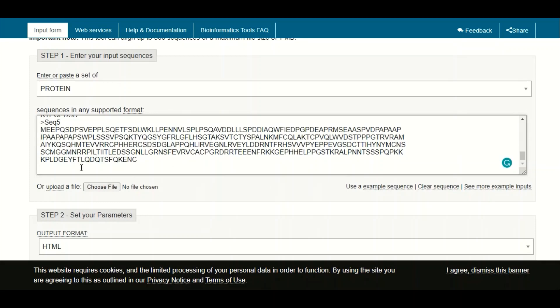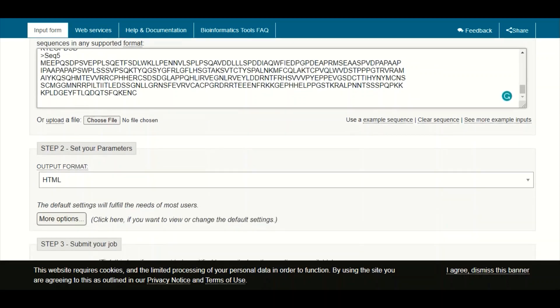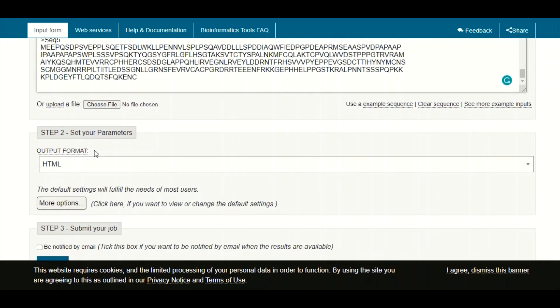Alternatively, you can also upload a sequence file here as well. At the bottom, the most important option is the output format. There are different types of output formats available here.